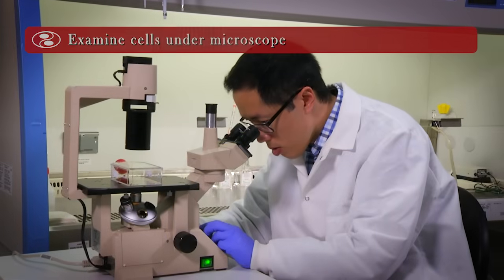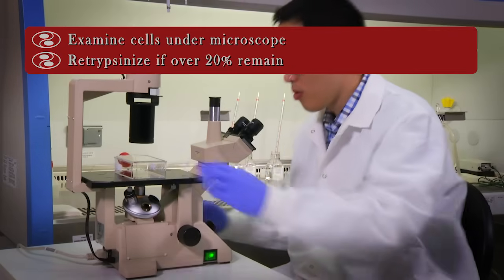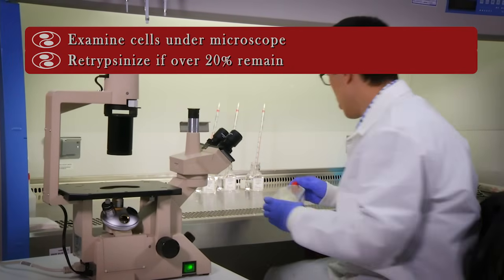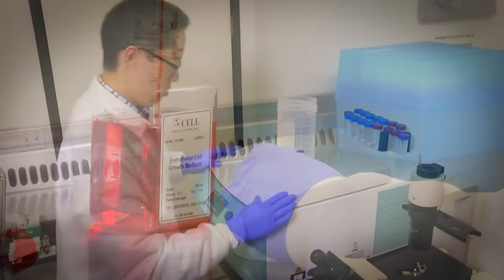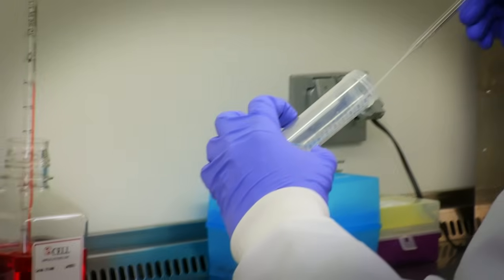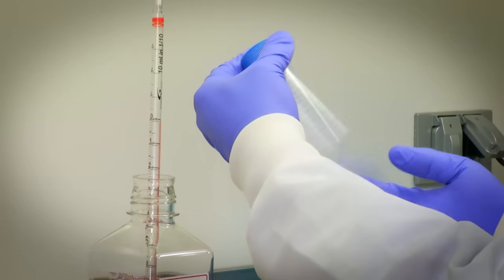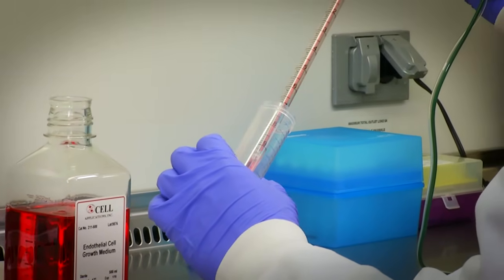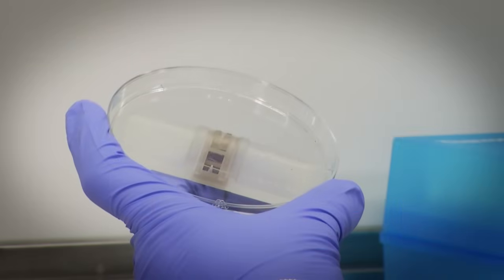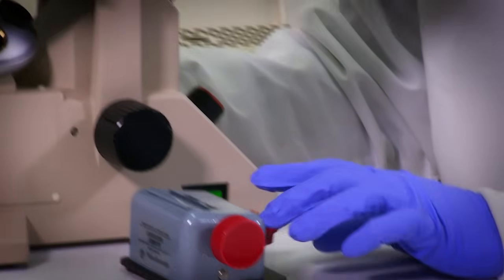Add 5 ml of trypsin neutralizing solution to the flask to collect any additional remaining cells and transfer them to the same conical tube. Examine the T75 flask under a microscope. If there are still more than 20% cells remaining in the flask, repeat the trypsinization steps and add the cells to the conical tube. Centrifuge the conical tube at 220 times G for 5 minutes to pellet the cells. Aspirate the supernatant from the tube without disturbing the cell pellet. Flick the tip of the conical tube with your finger to loosen the cell pellet. Re-suspend the cells in 2 ml of growth medium by very gently pipetting the cells to break up the clumps. Count the cells with a hemocytometer or cell counter.